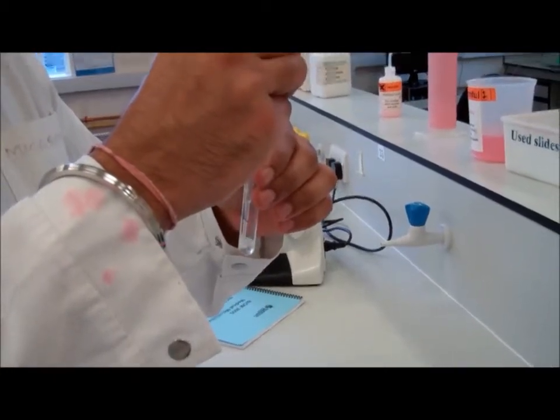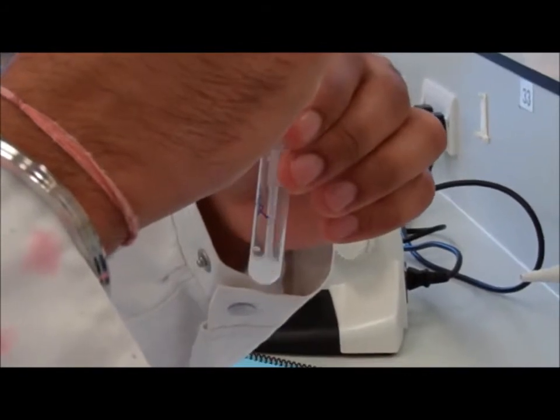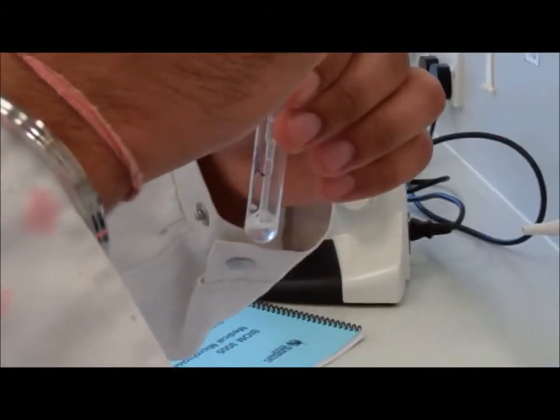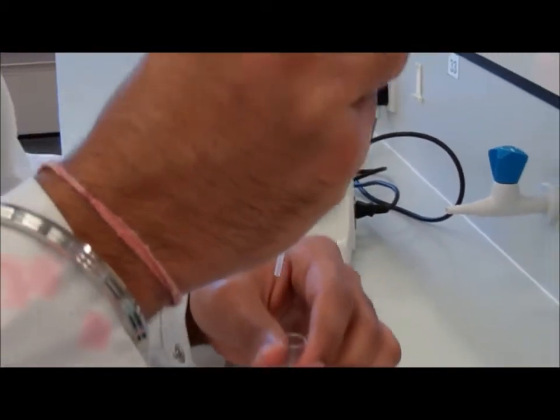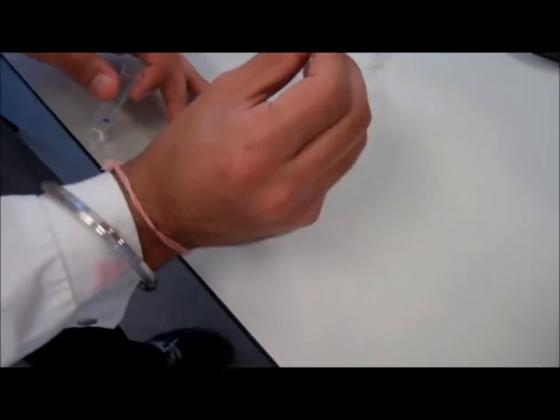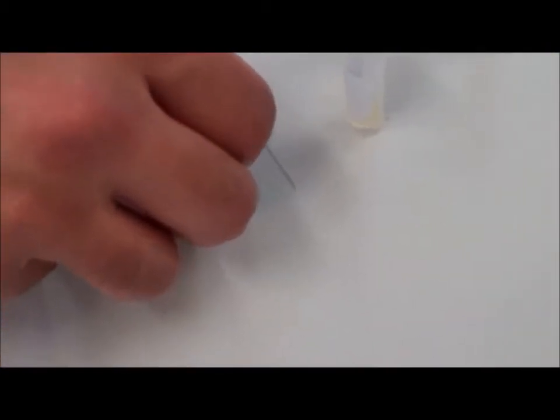This tube contains a nail sample which was previously incubated in potassium hydroxide solution for two hours. Using a Pasteur pipette, one drop of that suspension is placed onto a glass slide. A clean cover slip is then placed onto the microscopic slide over the suspension. This is then ready for microscopic examination.